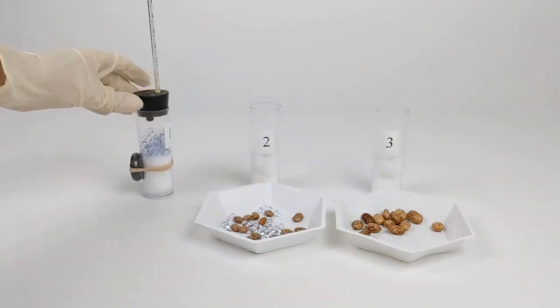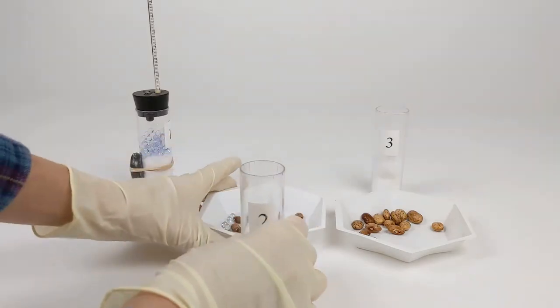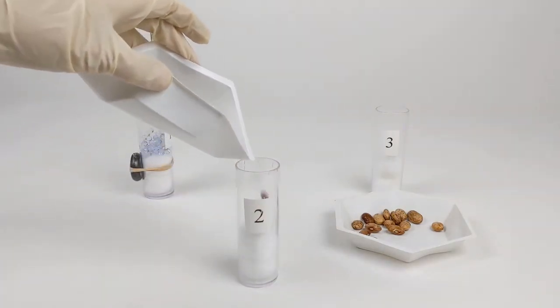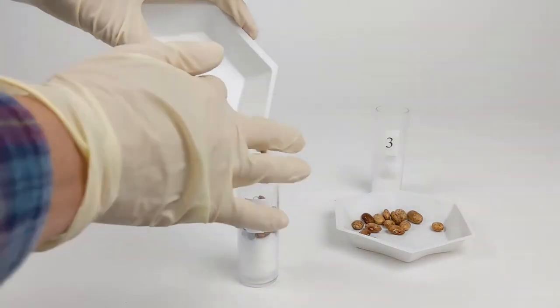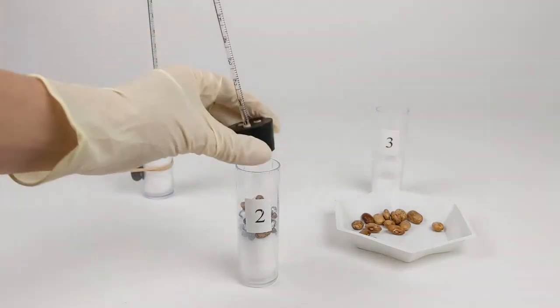Now we repeat this process with vials 2 and 3. Vial 2 has non-germinating beans and glass beads, and vial 3 has the germinating beans.